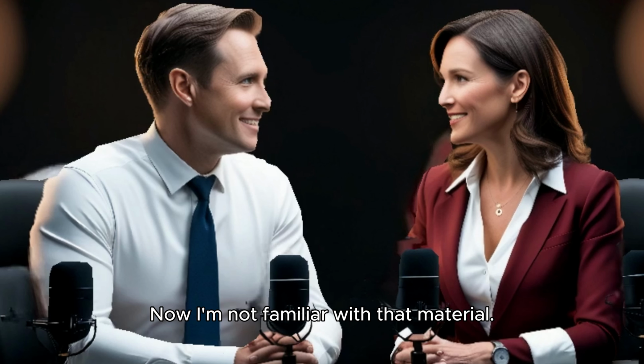Now, I'm not familiar with that material. It's pretty interesting. It has a unique surface chemistry that makes it really good at separating diastereoisomers. So it's like a high-tech filter for molecules. Yeah, you could think of it that way. And what did they find?